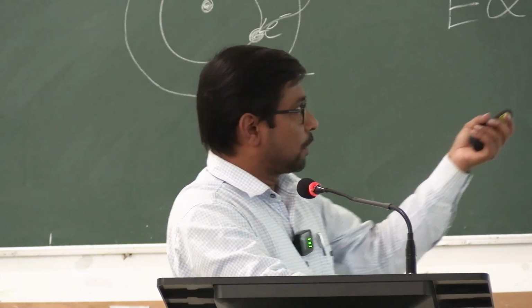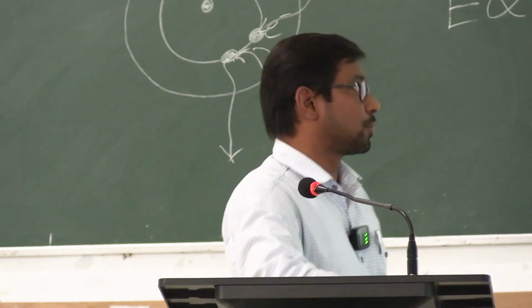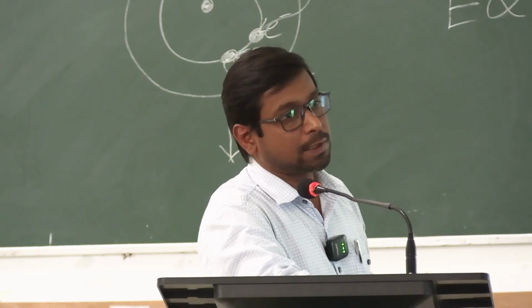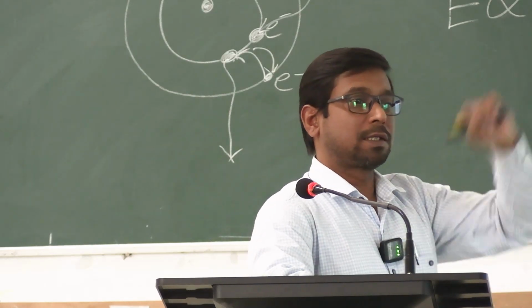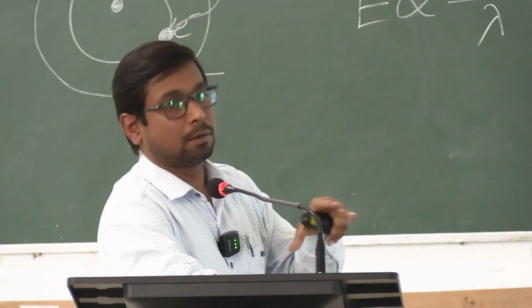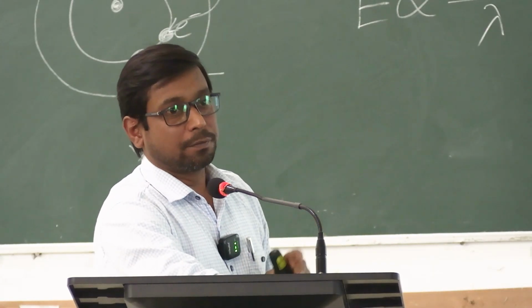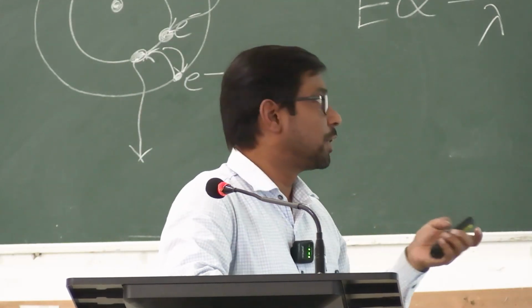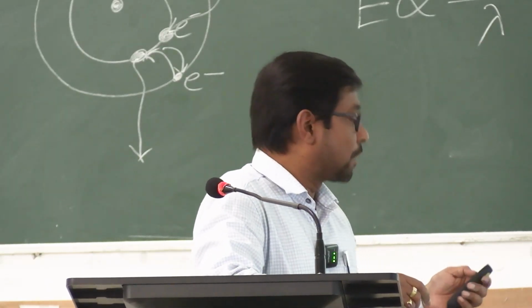And the confocal microscope is like this. Okay. Next comes the electron microscope. There is the transmission electron microscope, and another is the scanning electron microscope. Transmission means it will pass the beam through the specimen. And scanning electron microscopy gives the 3D structure of the specimen, and we can measure that outer structure and how it is. I will go through that image. You can find that particular image in scanning electron microscopy.